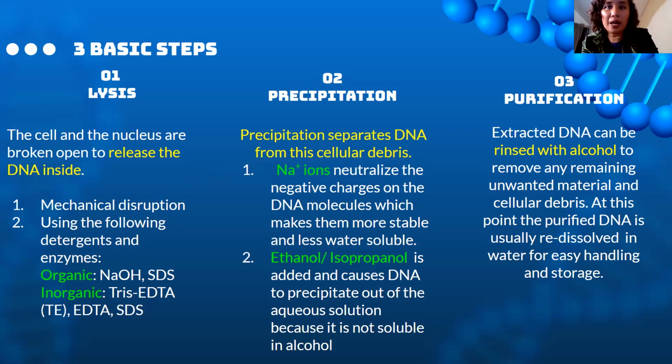And guys, did you know, take note your DNA has a negative charge. So the scientists, they're so clever. Because isn't it that opposite charges attract, okay? So they used the negative charge of the DNA. They would get a bead with a positive charge, then they could magnetize the DNA. So that's a way of extraction in other methods. So take note that DNA has a negative charge.